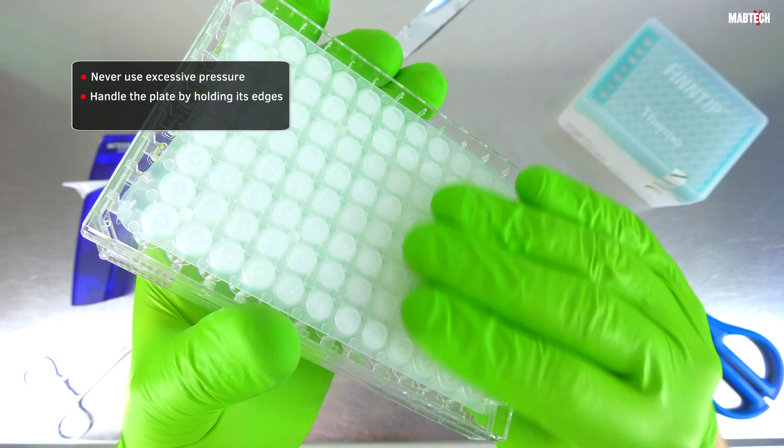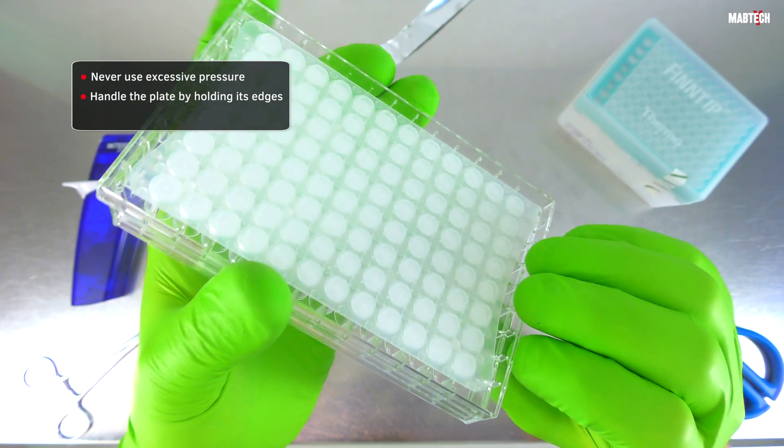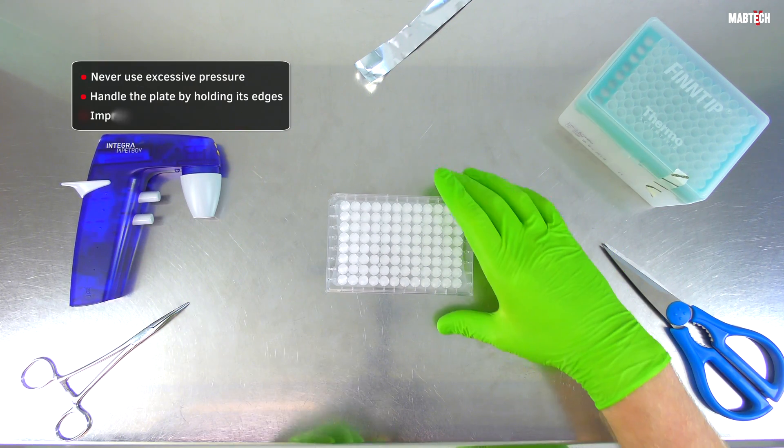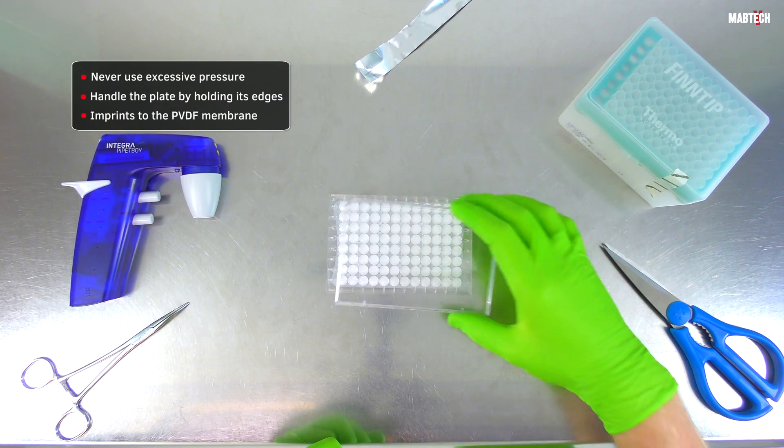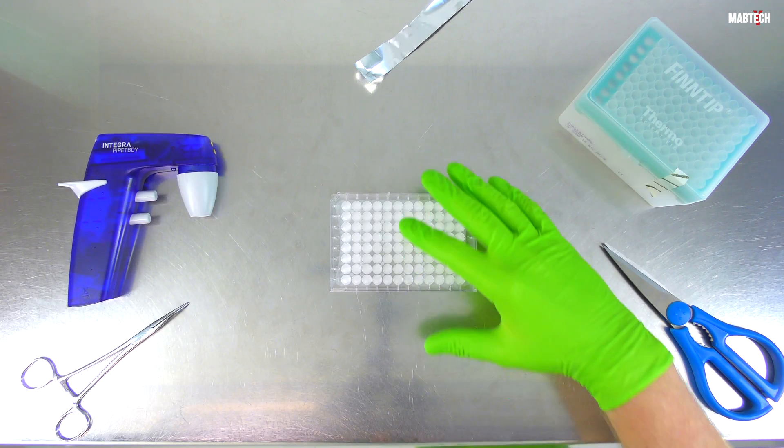You see, the underdrain is of a rather soft structure, so a very firm set of fingers can unfortunately lead to the plastic flexing back into the backside of the membrane, causing imprints to the PVDF membrane. The exact nature of these imprints we will come back to later.